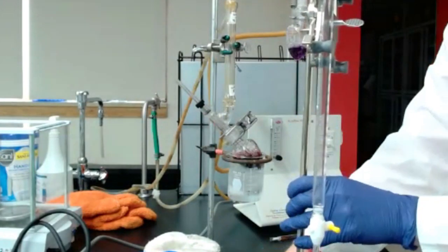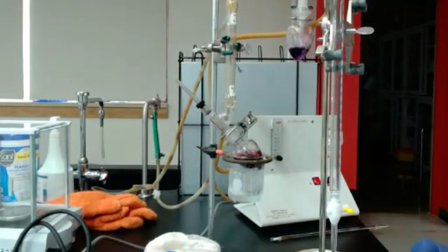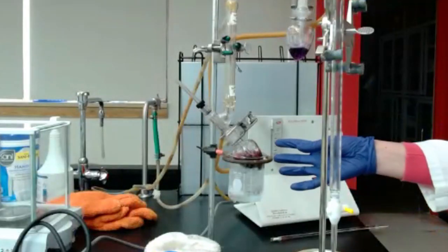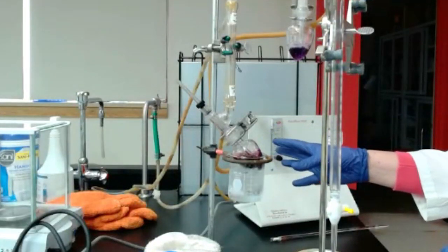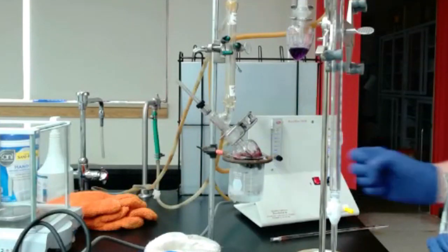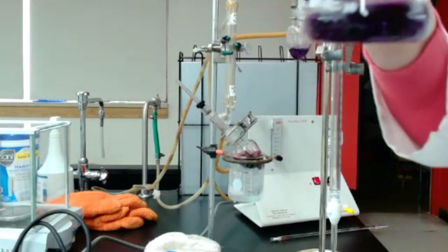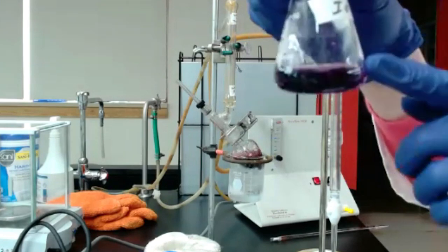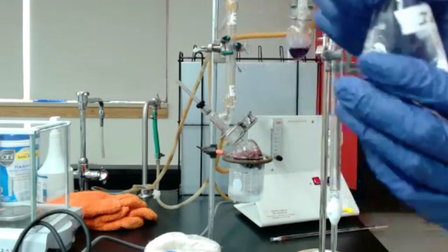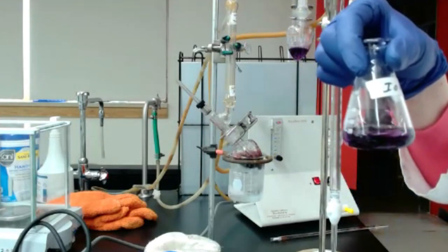What we have been doing, preparing before the workshop, was total SO2 for the 2 wines we have. So we did run total SO2. We heated that wine directly, and just by heating directly, that's how you measure total SO2. So you heat, and that's what you obtain. At the end of heating, I had that color. This solution was coming from this flask after total SO2 analysis.